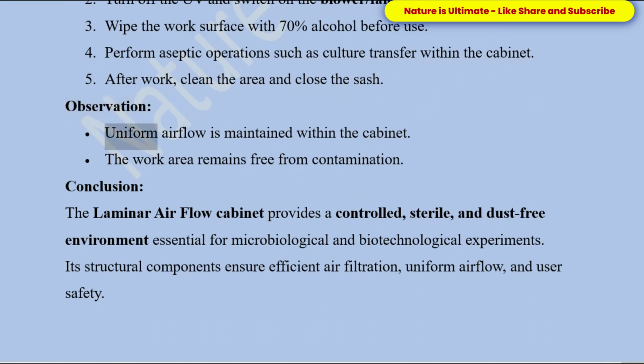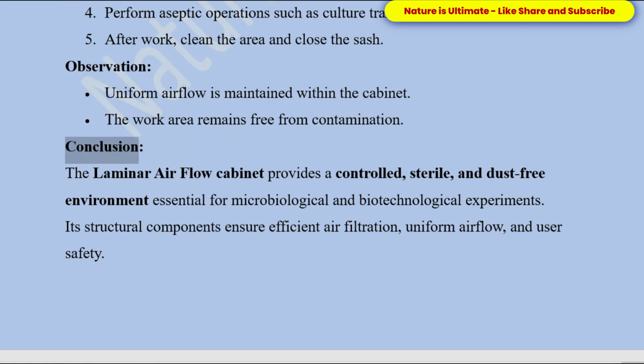Observation. Uniform airflow is maintained within the cabinet. The work area remains free from contamination. Conclusion. The laminar airflow cabinet provides a controlled, sterile, and dust-free environment essential for microbiological and biotechnological experiments. Its structural components ensure efficient air filtration, uniform airflow, and user safety.